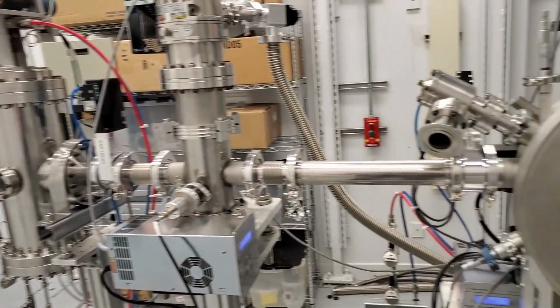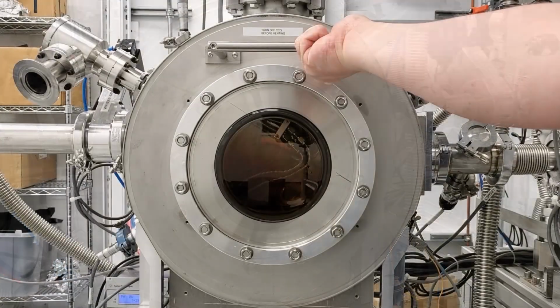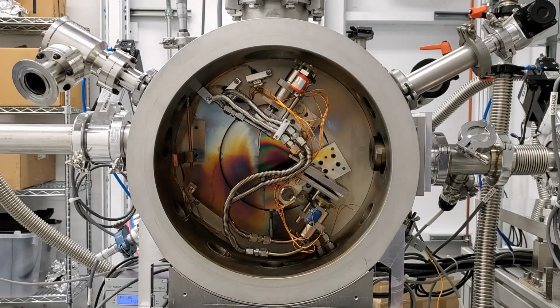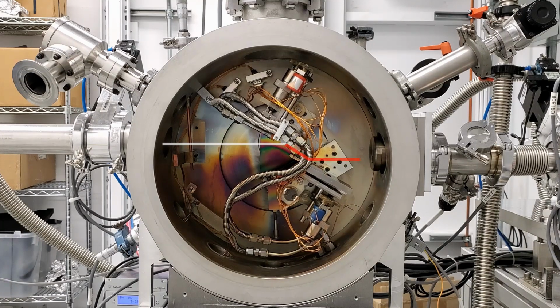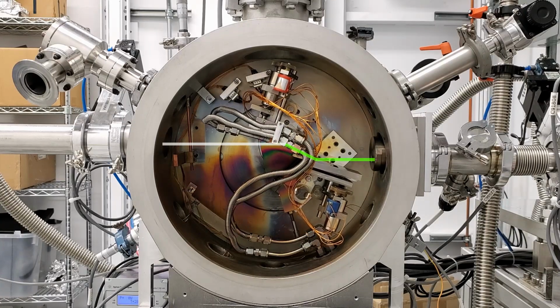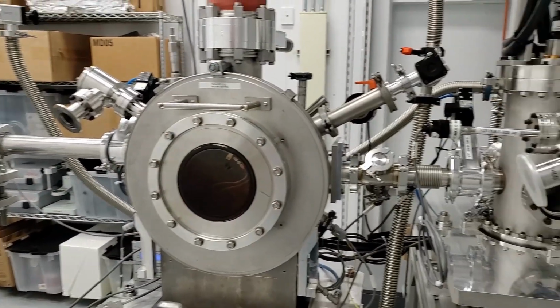After the diagnostic screen is the double crystal monochromator. This device allows us to select the specific energy or wavelength of light that we require for a particular measurement. It does this using a pair of diffraction crystals. The light from the synchrotron diffracts off of the crystal, constructive interference allowing only certain energies to continue on, determined by which crystal and the angle the light strikes it at. A second crystal rotates along with the first crystal, and translates up and down to keep the resulting beam parallel and at a constant height.